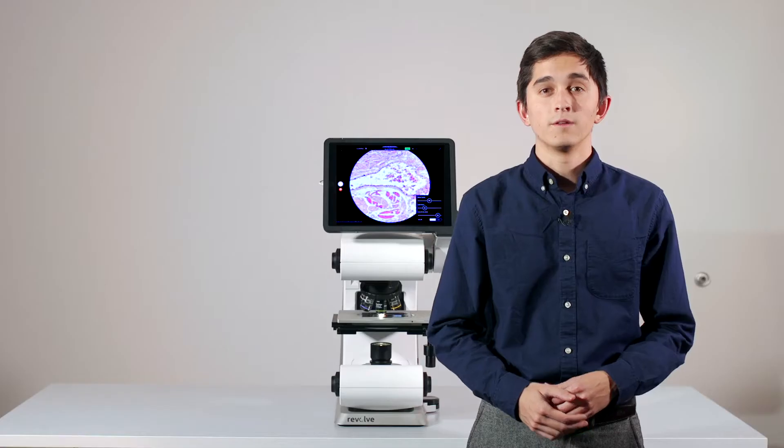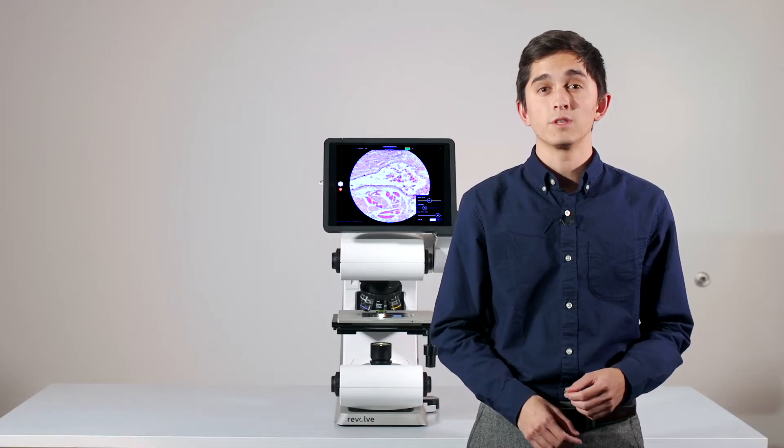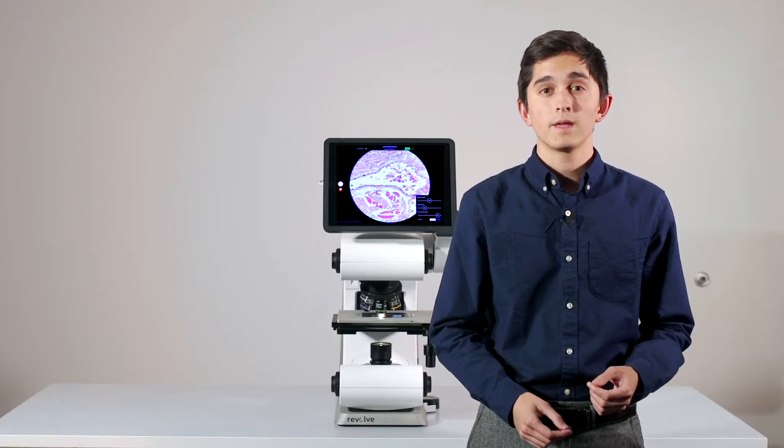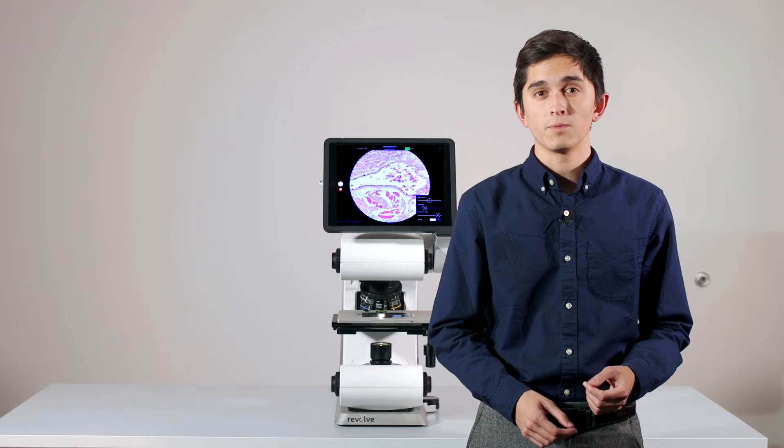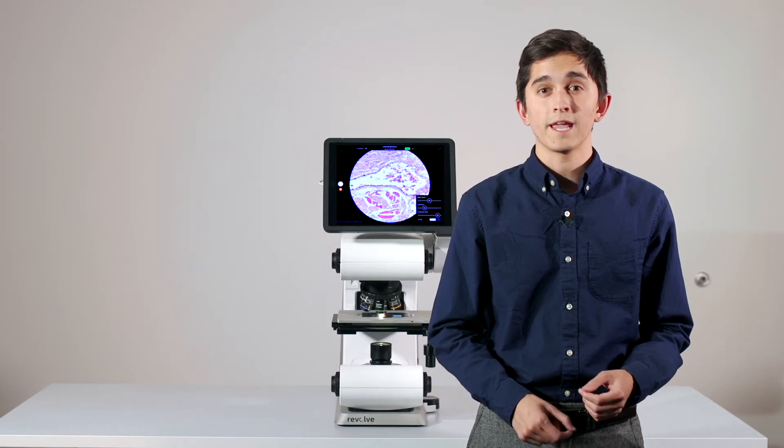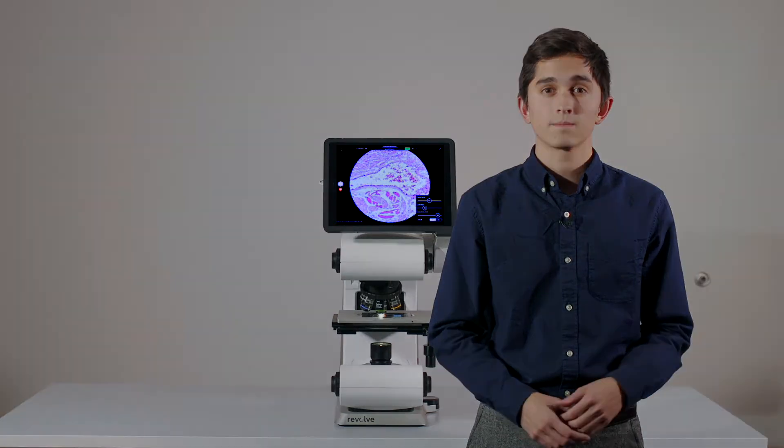In the following segments, we'll take some time to review the software app and microscope in bright-field and fluorescence.